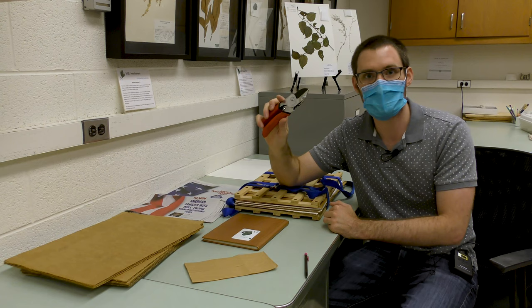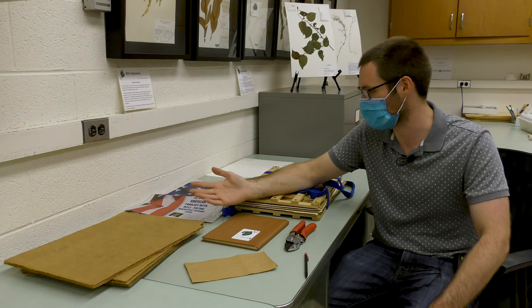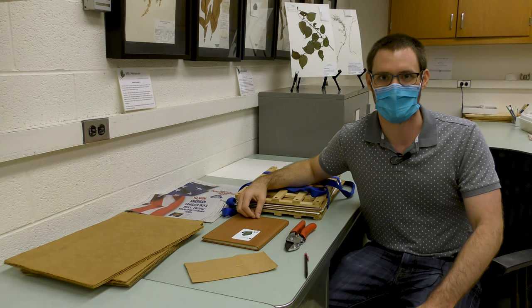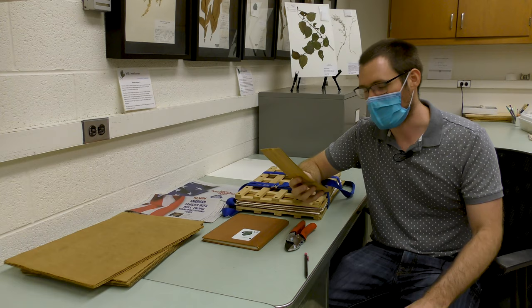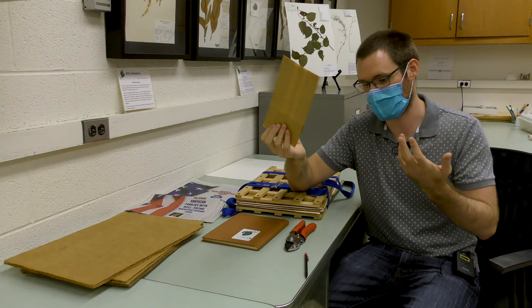I'll also bring clippers — for example if there's a shrub or tree you want to collect from and you can't get the entire plant, you can use clippers to get a piece of it. I don't have a trowel with me because one of the botanists has checked it out, but it's just a small shovel. If you collect things like acorns or walnuts that obviously can't go in a plant press because they don't flatten, you can put those in paper bags and then those can go in the drying oven.